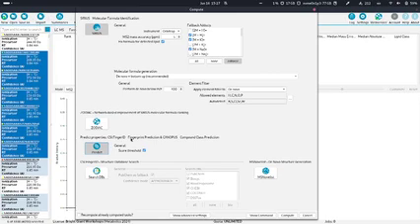Also, as Kai said in his talk, there's a part of the whole SIRIUS suite which does de novo computations, and we also do structured database searches.